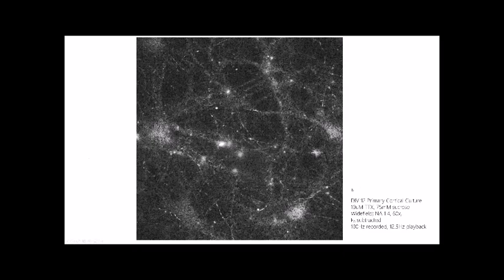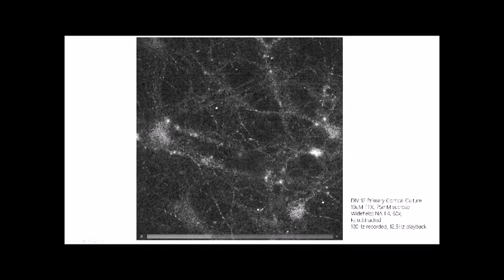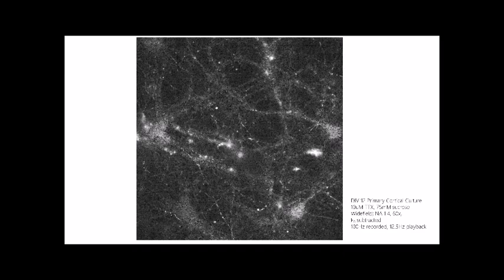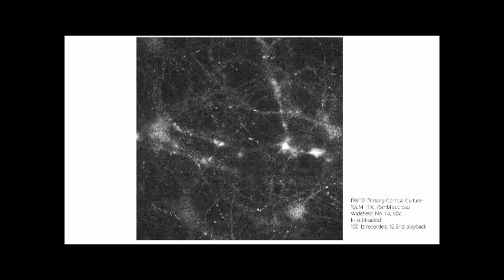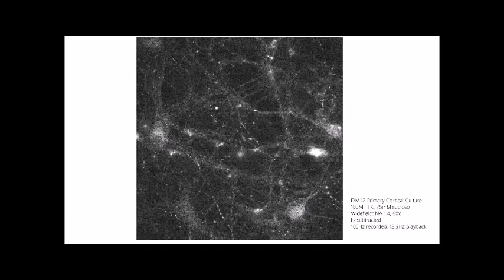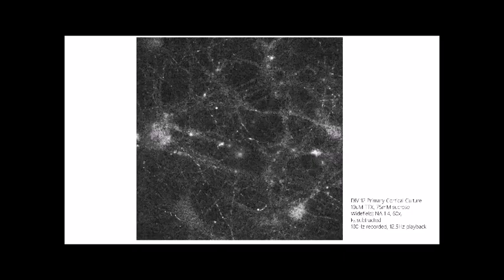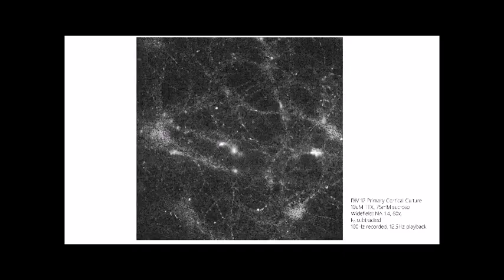So glutamate is released from vesicles at synapses in response to action potentials, as I mentioned. But if you block action potentials, you still see what's called spontaneous glutamate release, which happens when basically individual vesicles are asynchronously, sort of randomly, fusing to the membrane. And iGluSnFR3 is sensitive enough to easily watch these spontaneous fusion events happening. So you can look through the eyepieces of your microscope and see this stuff happening. And these are called optical minis.